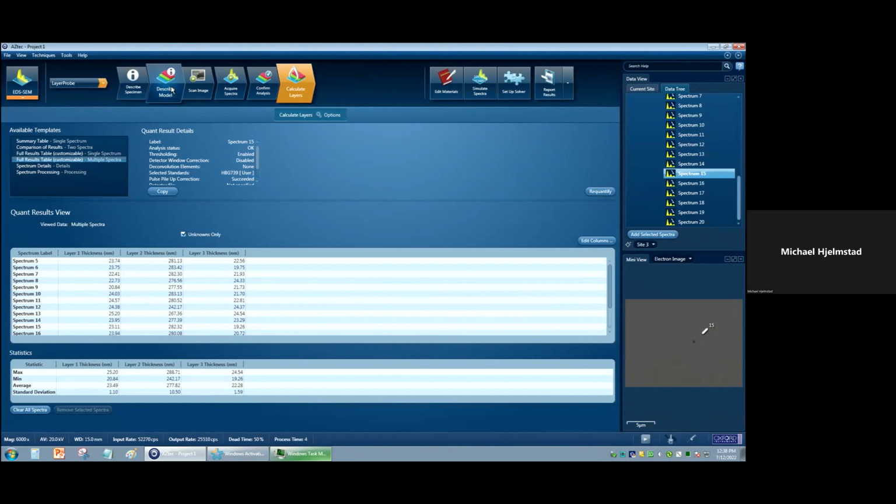And then we will just do this last one really quick to stay on time. What is the minimum layer thickness that you can detect using this method? It kind of remains to be seen, but if you saw the presentation, the example that was in there was a single monolayer of molybdenum disulfide, which was sub-nanometer differences there. So there really is the capability to go right down to the nanometer scale.